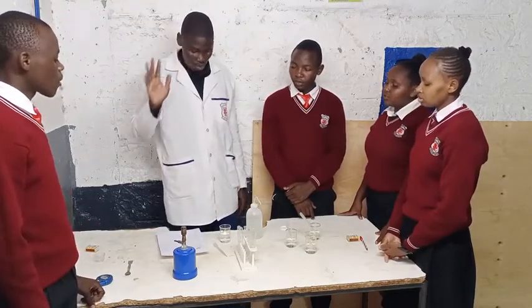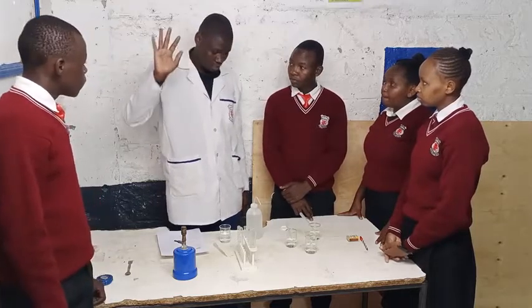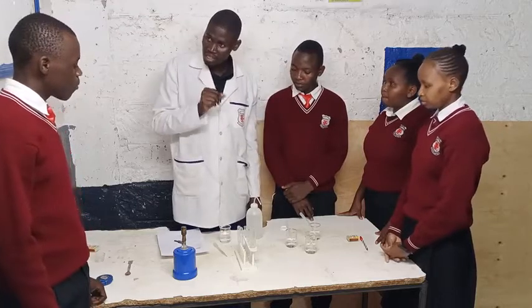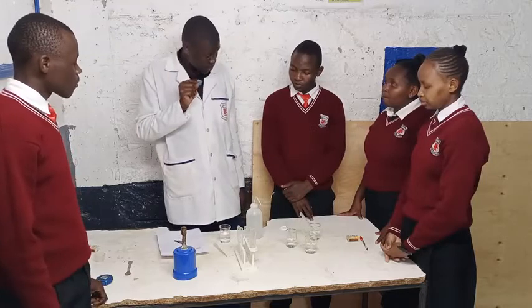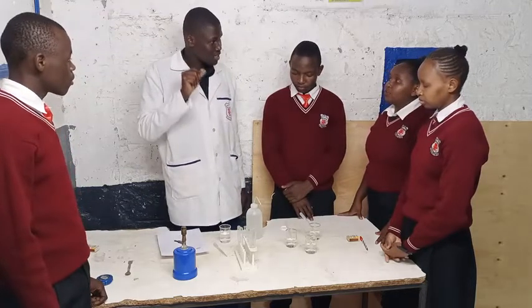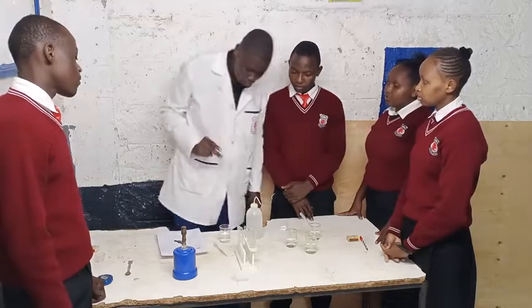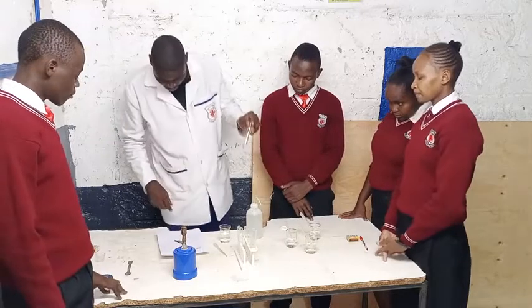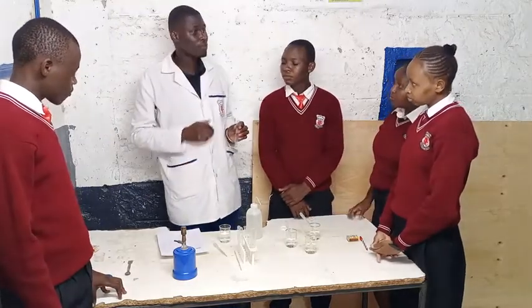We are using the elimination method. Remember zinc, we didn't write it when we were using ammonia. Because if it was zinc, it could have dissolved in excess amount to give us a compound called tetraamine zinc 2 ions.